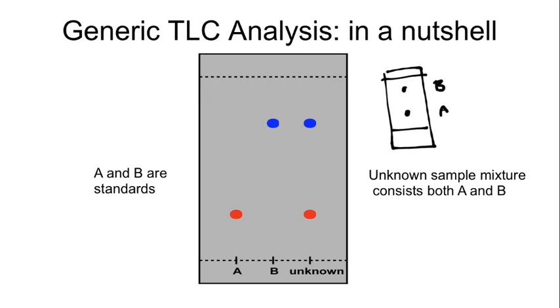Okay, well, our compounds traveled a further distance because our solvent pushed harder. Okay, well, what did our solvent have to do? Why was it pushing harder? It's pushing harder because it was polar. Okay, it broke the intermolecular forces holding our compounds to the stationary phase, so it was a more polar solvent. If I want my compounds to travel less, what do I need to do? That's right, what I'm going to end up doing is making my solvent more nonpolar, so that if I run the same plate, I can expect my compounds to travel a little bit less.